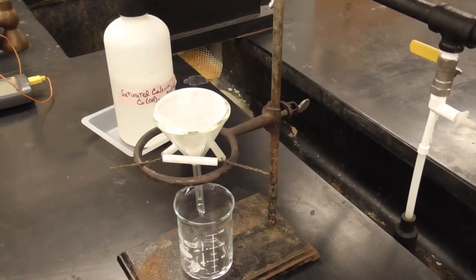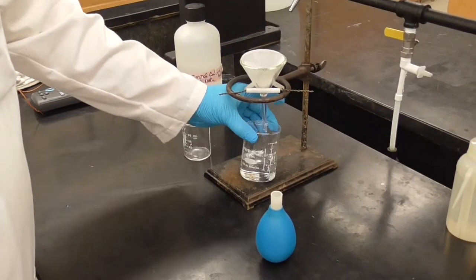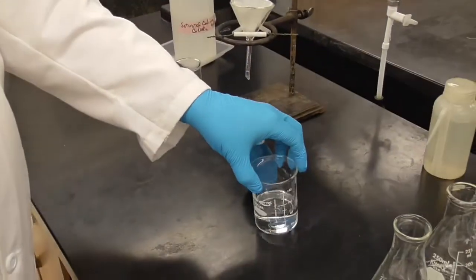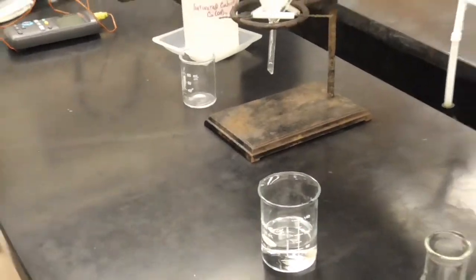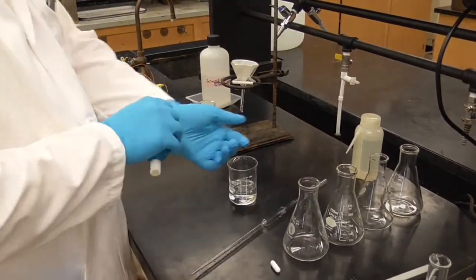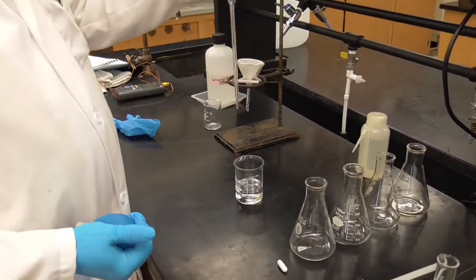Unfortunately, this does just take a little bit of time. So we filtered the solution. We got about 60 milliliters in here. And then it says to pipette with a 10 mL pipette into 4 different Erlenmeyer flasks. So I've got my 10 milliliter pipette here, and it works better with my glove on. So I'm going to go ahead and pipette.